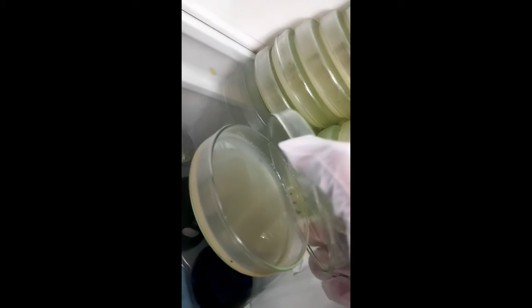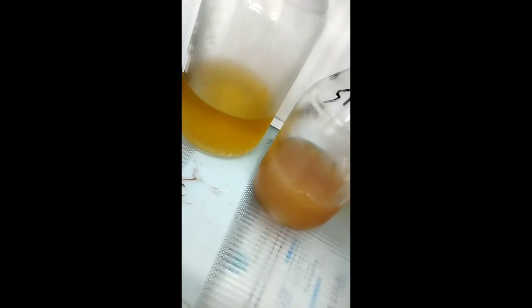This is the coliform chromogenic agar for the confirmation of E. coli and coliform in water. Two vials of distilled water used for media preparations. This is the vial of Ringer solution used as a diluent. Vial of standard method agar. And this is the peptone water.